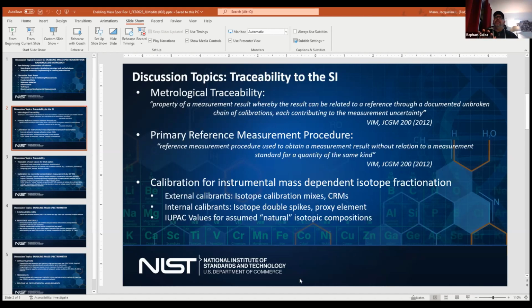But if you have a certified reference material and one that is not well understood, don't you measure that? Don't you put the abundance ratios or the isotope ratios in that sample that you're offering as a CRM? Well, usually if I'm in a situation where I might be missing. Do you understand? Is it measured? Is it something that you measure when you're evaluating a CRM? Yes, I think to answer that question is yes.